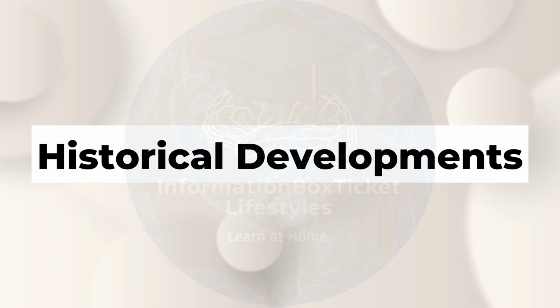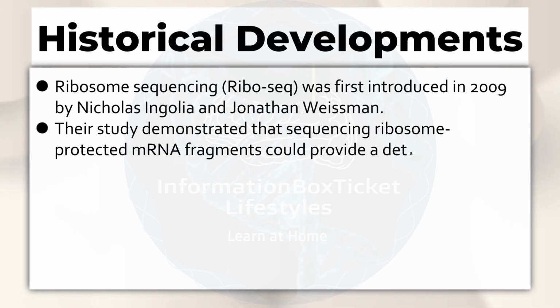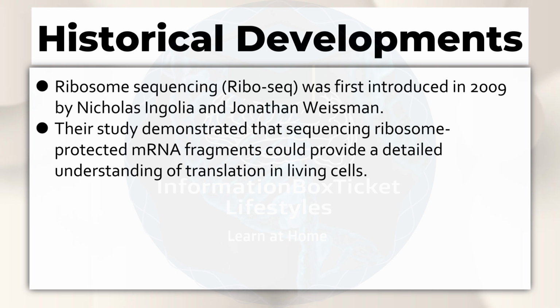Historical developments of ribosome sequencing. Ribosome sequencing was first introduced in 2009 by Nicholas Ingolia and Jonathan Weissman. Their study demonstrated that sequencing ribosome-protected mRNA fragments could provide a detailed understanding of translation in living cells.